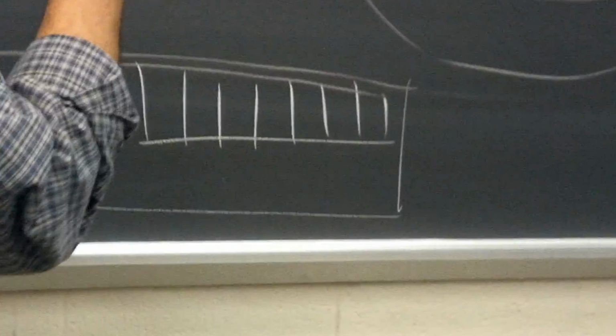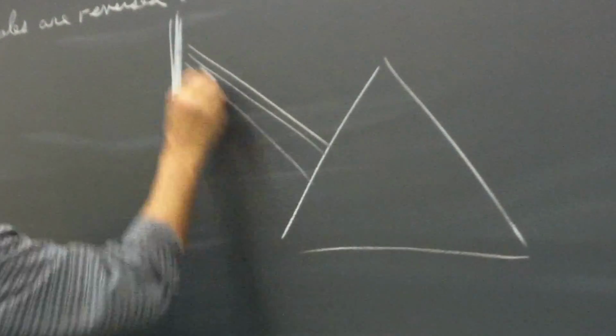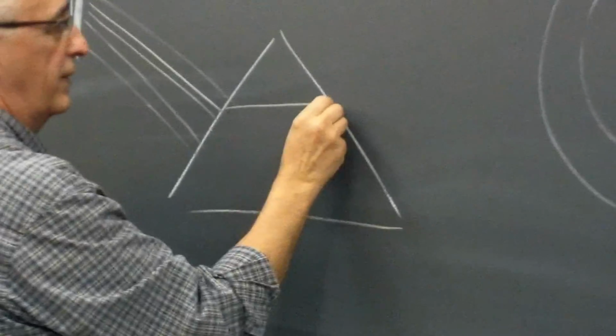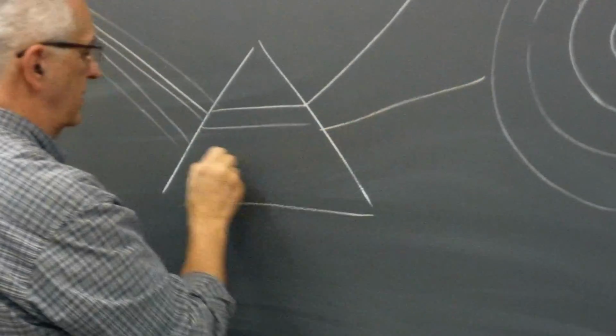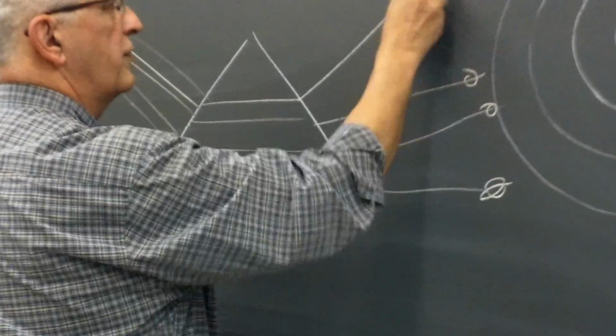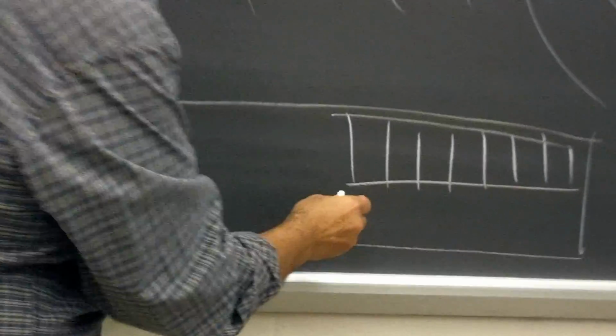Now, what is this? This is actually a spectrum. What you're doing is you're looking at the light as it passes through a prism. The prism is going to break up the color of the light coming in. So here comes the light from this tube. This tube is lit, and the light is going to be shining on this prism. The light is then going to collect and is going to then be reflected upward in different angles depending on the light itself. So you may get 1, 2, 3, 4. It'll separate the light into its various colors. And these lights are then projected onto the screen, and the screen has numbers on it.